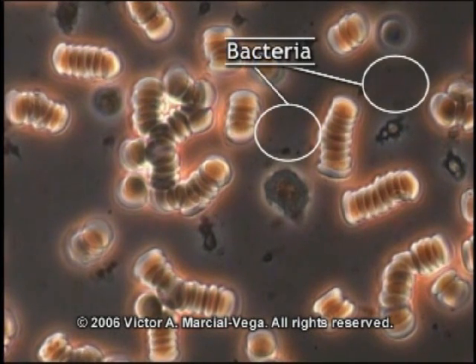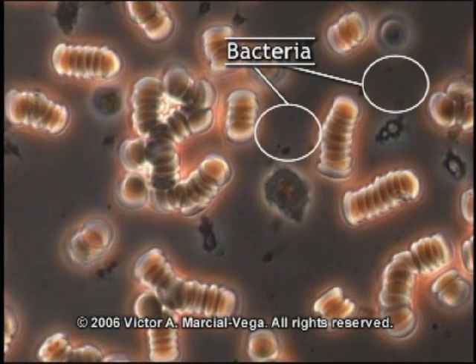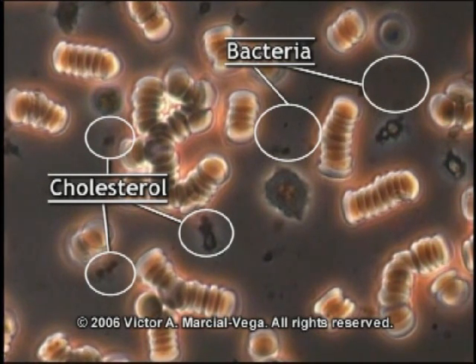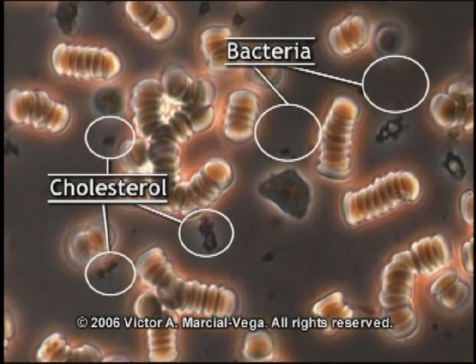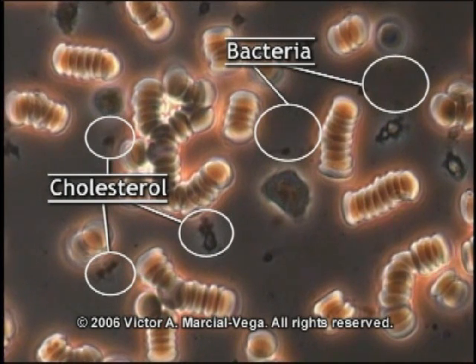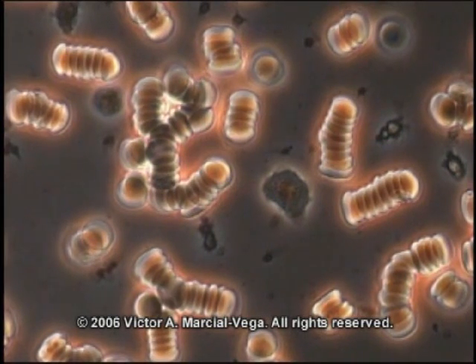You see these little dots in the background? These are bacteria in the blood. We are not sterile. In this particular person, the bacteria levels are way above normal. These dark spots here in the background are pieces of cholesterol. These pieces clog up the small arteries. The smallest artery is the size of one of these round red blood cells. So this one over here can clog a capillary, preventing this from coming in. That's where hearts are clogged up with cholesterol pieces. That's where brain clots happen. And these are blockages that happen from these pieces. Bacteria continue increasing the acidity, making the problem worse.